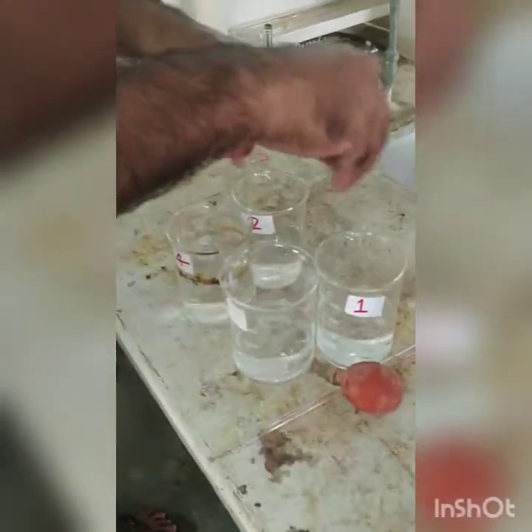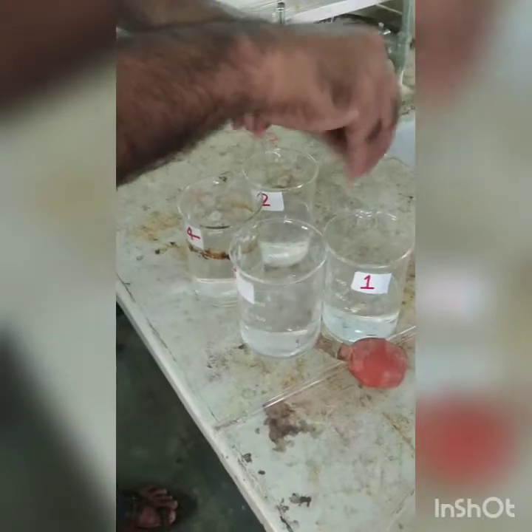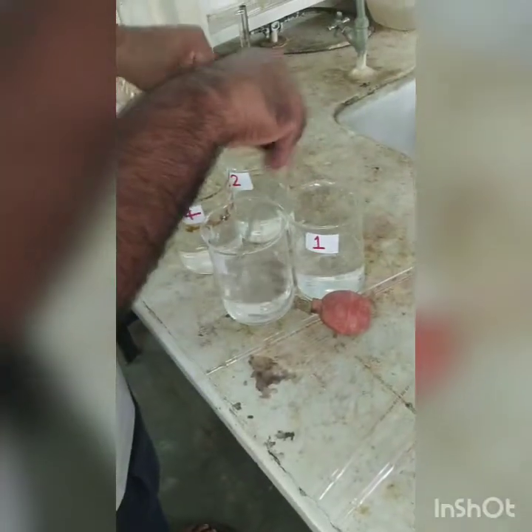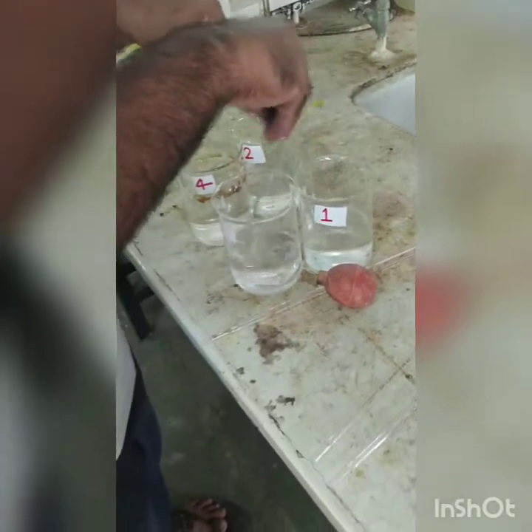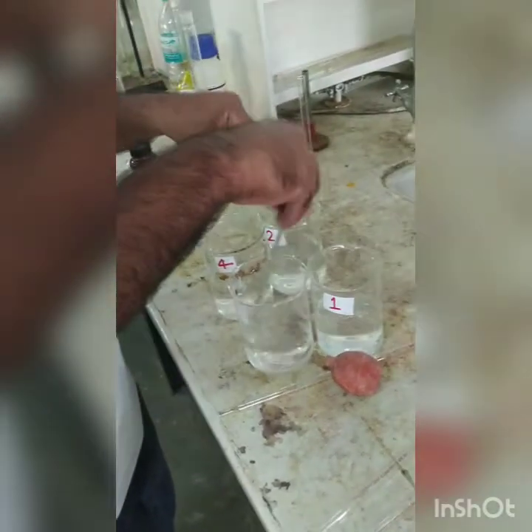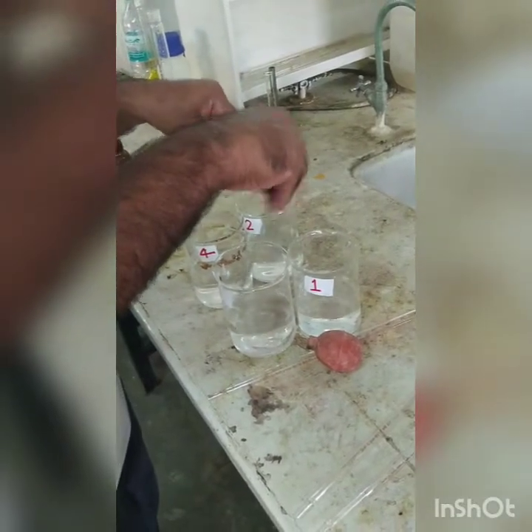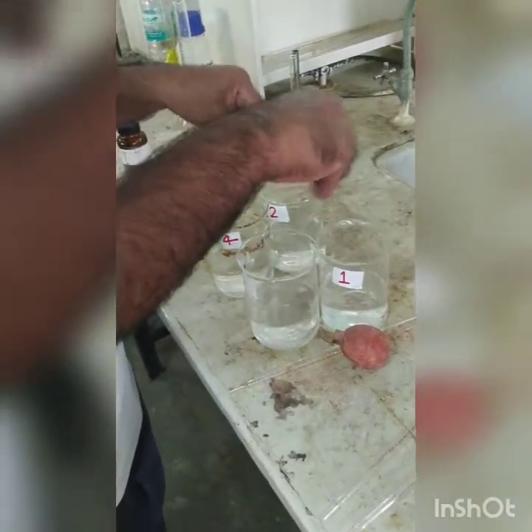We have to do the stirring. So we will continue the stirring for 10 minutes and then we will do the further part. So we have continued stirring for 10 minutes. Now 10 minutes are getting over. Ingole sir, you can stop stirring.